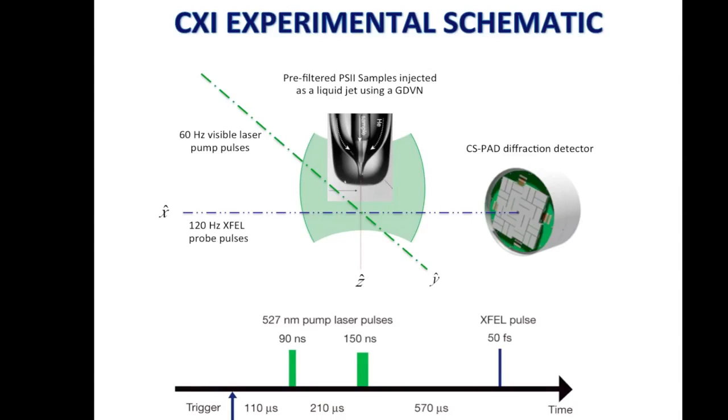The time scales of the triggering, the pulse widths, the pulse durations, and the interflash timings are all presented at the bottom of the screen. They are generally calculated by assuming an idea of the reaction half time for the products to form, and then taking 3 times the half time. That gives you about 90% of product formation.